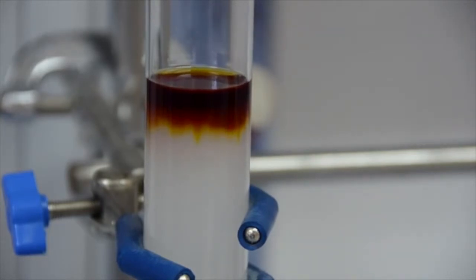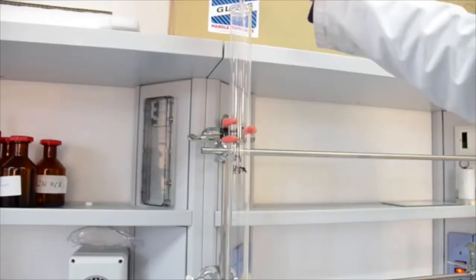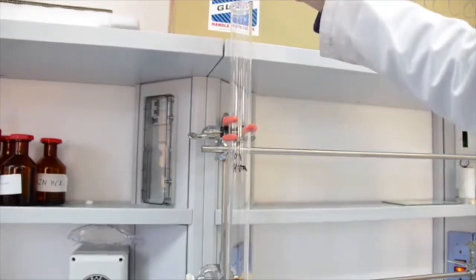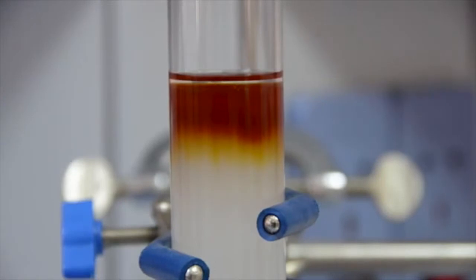Once all your sample has entered the column's surface, but there is still a minute layer of solvent above, add another pipette of eluent. Run down the solvent slightly further to ensure all the sample has entered the column.